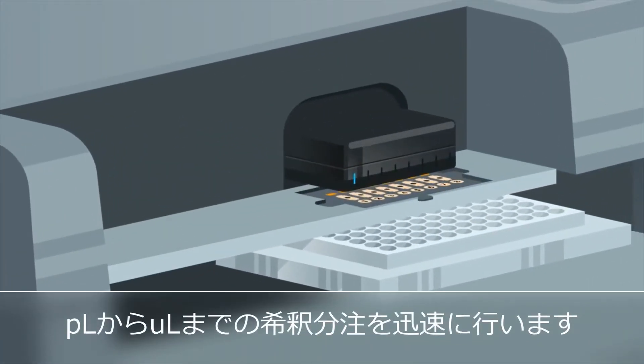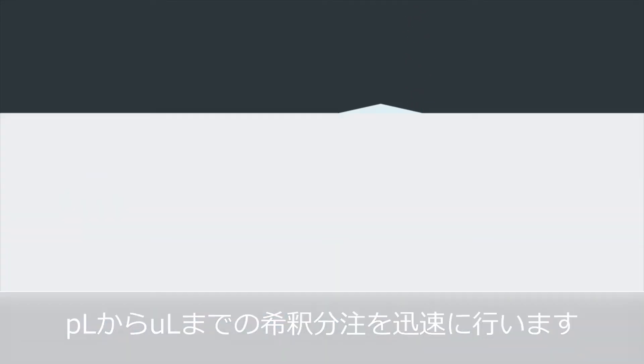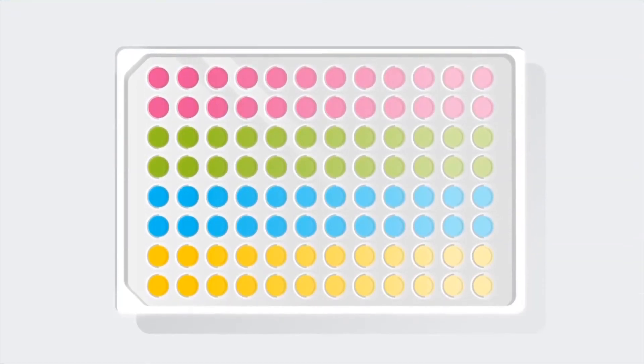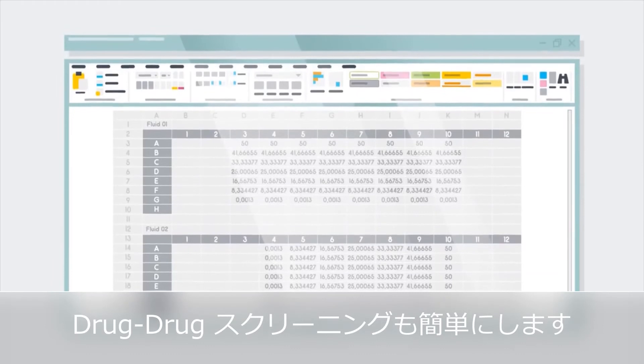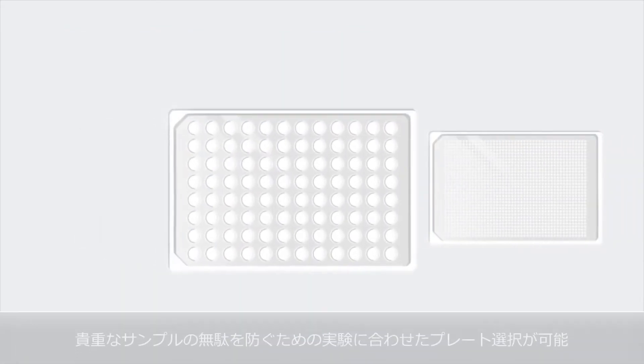It eliminates the need for serial dilutions by dispensing picoliter to microliter volumes right from your stock in seconds. Even synergy experiments can be easily set up. You can use different plate formats to save precious samples.